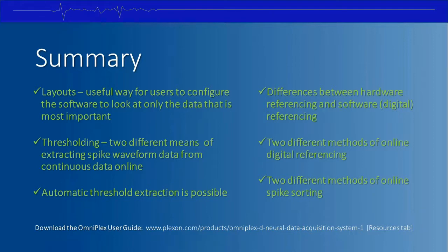We talked about 2D polygon, which is classification by drawing a contour in feature space, and only the waveforms that are plotted into that contour will be sorted as part of that unit. Using 2D polygon sorting, we demonstrated the valley seeking method for automatically sorting.